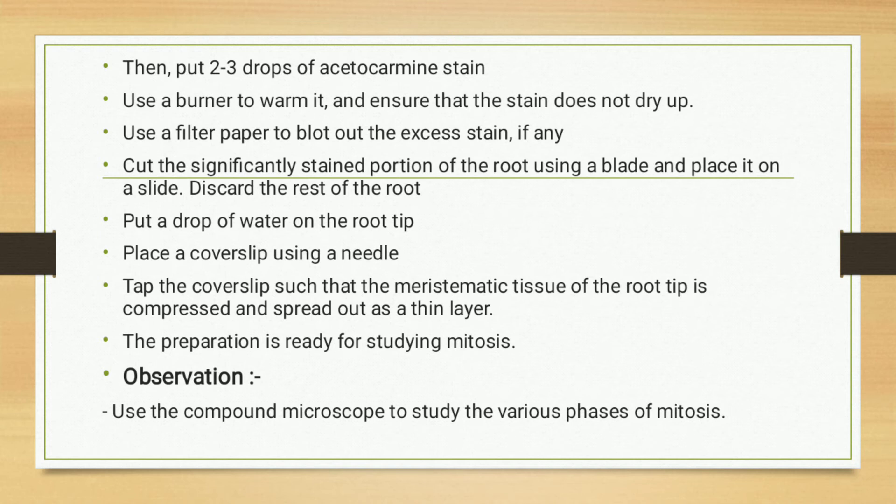Using filter paper, blot out the excess stain if necessary. Then cut the significantly stained portion of the root using a blade and place it on a slide, discarding the rest of the root. Put a drop of water on the root tip, then place the cover slip using a needle. Tap the cover slip so that the meristematic tissue of the root tip is compressed and spread out as a thin layer. The preparation is now ready for studying mitosis.